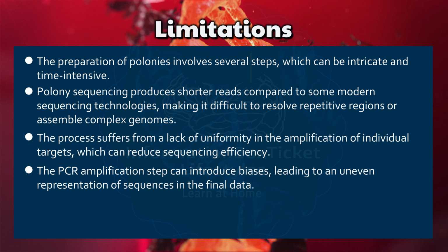Additionally, Polony sequencing has a lower throughput compared to newer high-throughput technologies such as Illumina and nanopore sequencing.